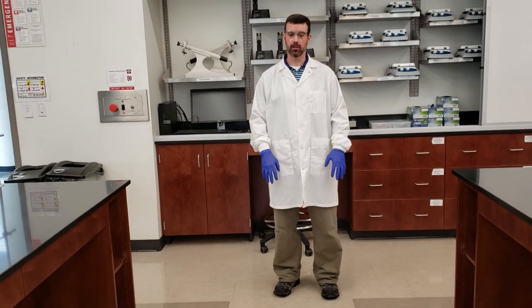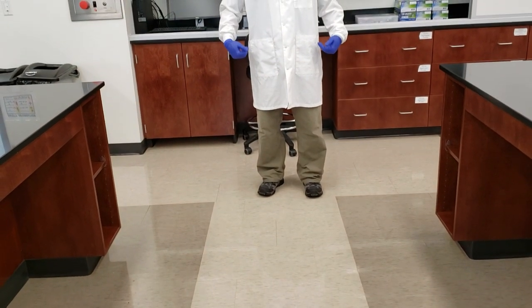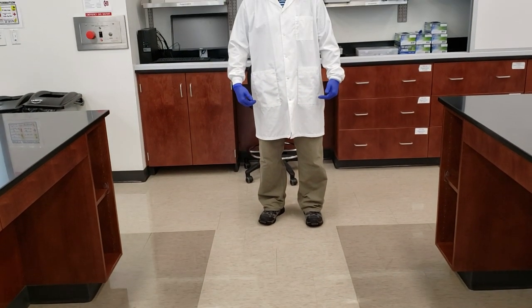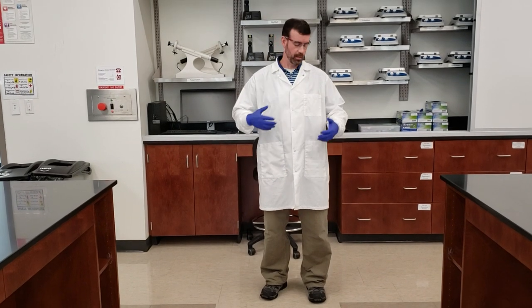The last thing before we end is proper dress code in the laboratory. Starting with shoes, closed toed shoes, full ankle length pants with no holes. We'll always wear a shirt with a high collar and wear our lab coat on top, always buttoned, never left open. We'll wear gloves anytime working with chemicals. Make sure we have our lab goggles on at all times when in the lab. If you have long hair pull it back in a ponytail. That takes care of our safety requirements. We look forward to working with you this semester. Good luck!